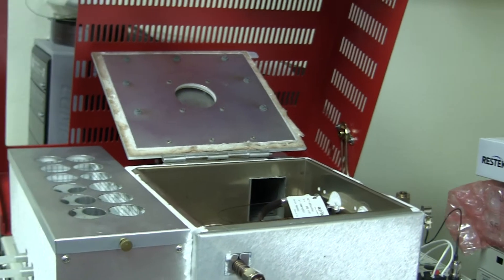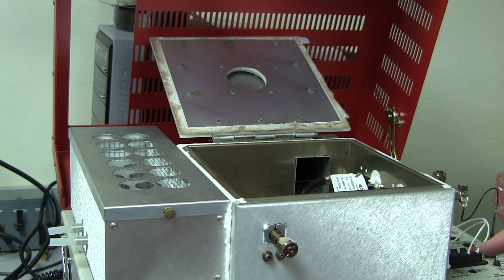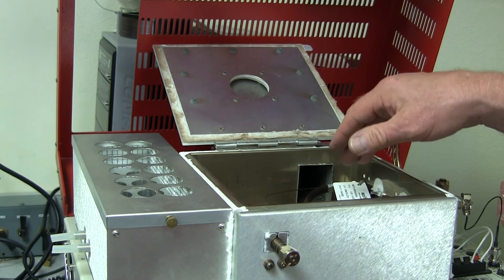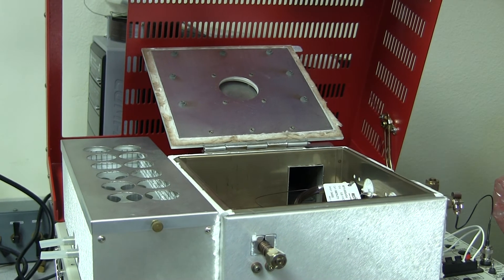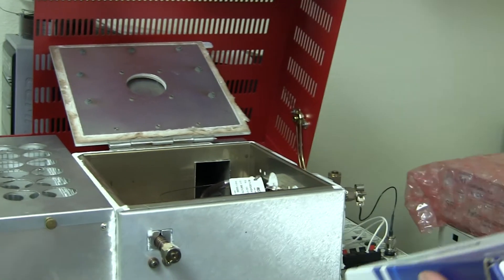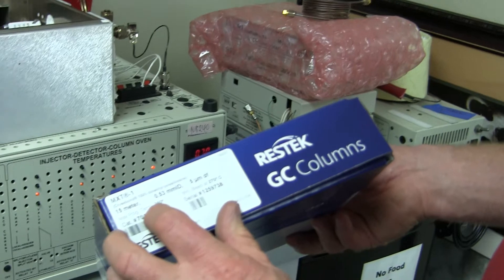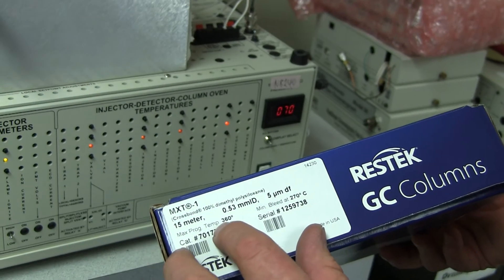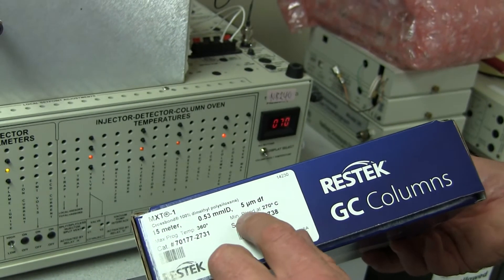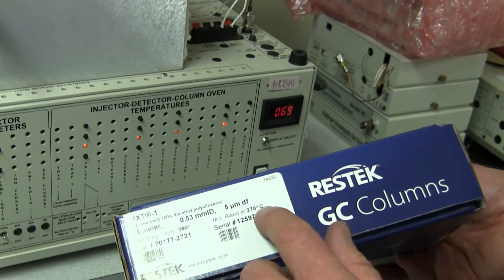But you have to know which column it is that you have in your oven because some columns don't have that high of a temperature limit. For instance, here's another column from Restek, MXT 1, says maximum program temperature 360 degrees and minimum bleed at 270 degrees.